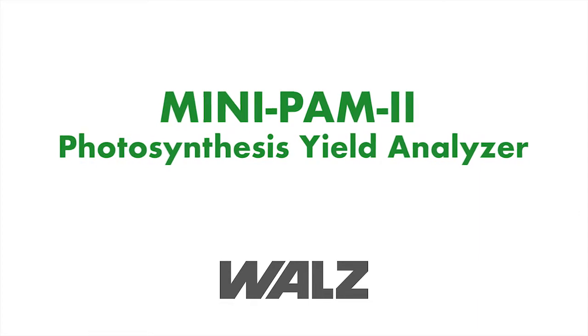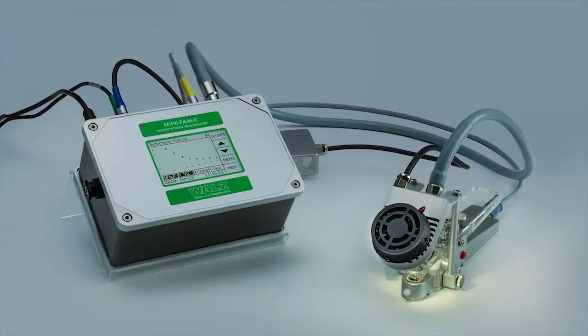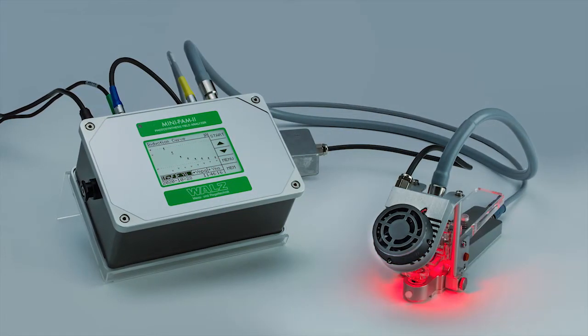This video highlights the MINI-PAM2 device. This fluorometer is especially designed for field operation but works equally well for studies in controlled laboratory settings.